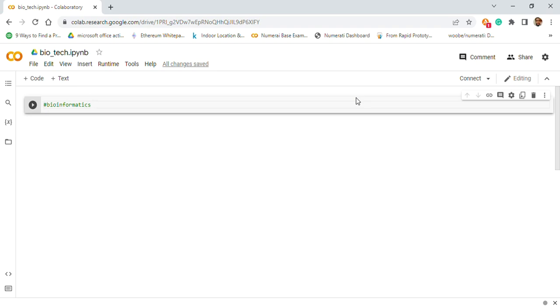So we are going to work with the human genome in this tutorial. But first of all, we will import the files that we need. I already have the data set and I'm going to upload it.